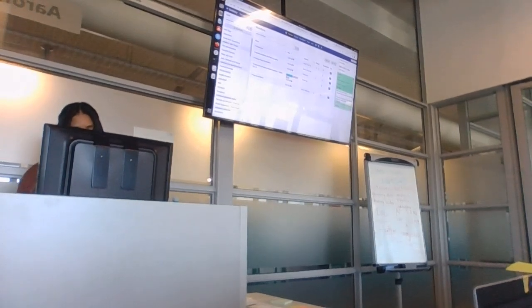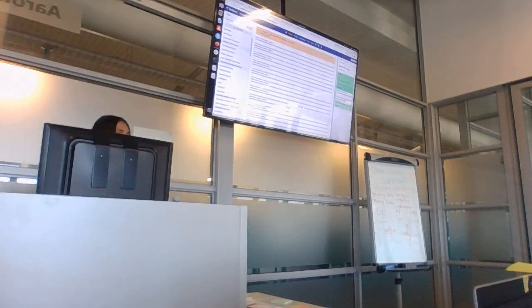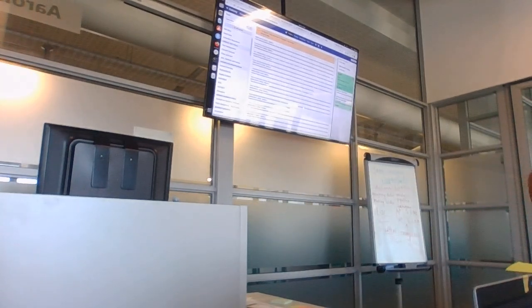Yeah. So when you give it to the tool, it's on the file. You put the file database. You see if this one is a species or different species, and it gives you a percentage. Remember that table? That one I understand. Perfect. So I don't know, this is just the thinking that probably there can be some variations.